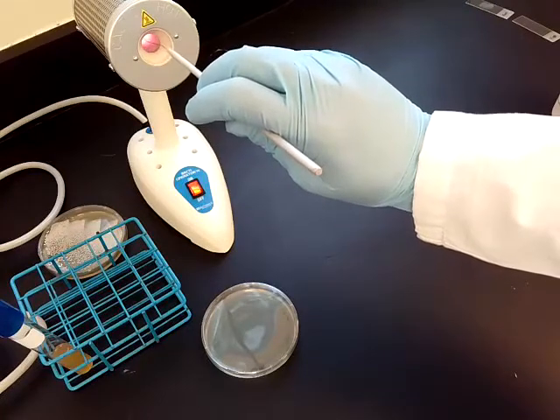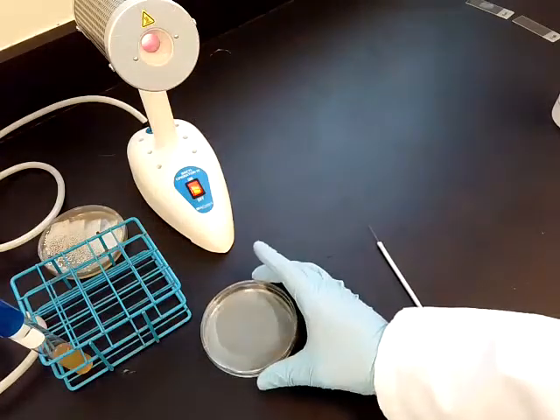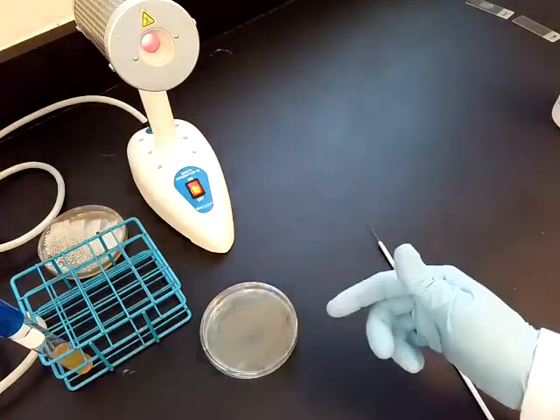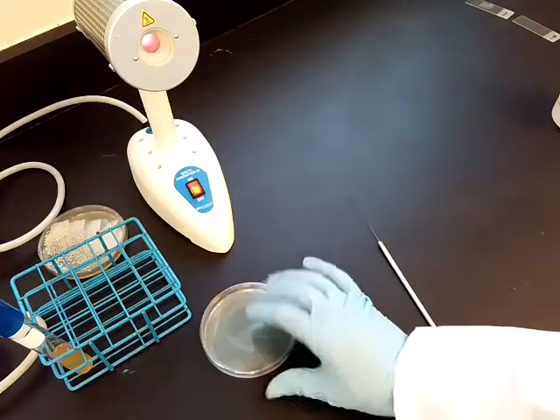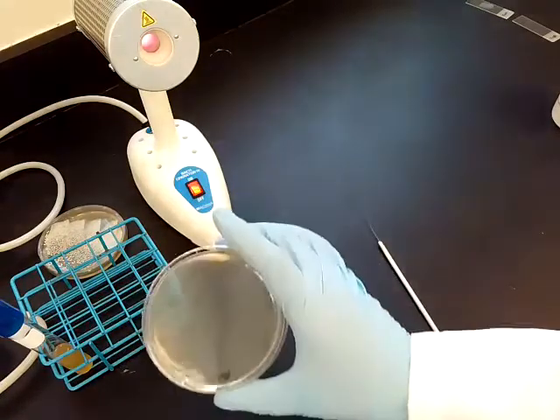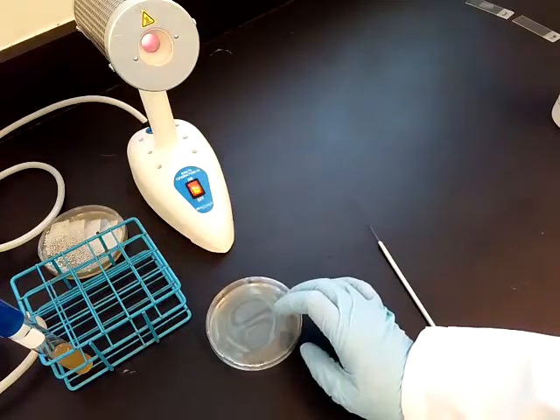You'll notice when I was doing this transfer that I only opened the top of the plate enough to get the loop in there. I also made sure not to take the plate off of the countertop. I left the plate on the countertop. That's the best way to do the streak plate method.